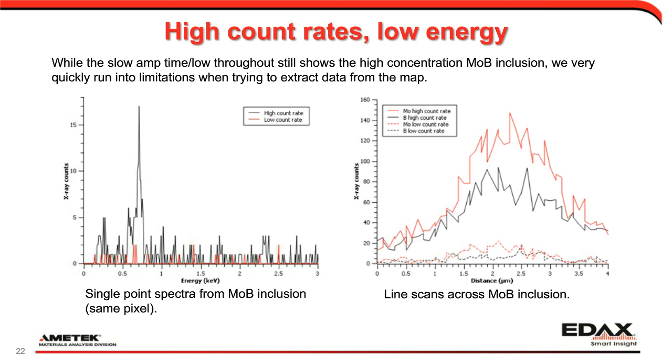And my boron peak, I actually have no counts in the low count rate, whereas we start to make out a peak in the high count rate. And take into account this is 1.6 milliseconds acquisition time. So it is rather noisy, of course, because of the low acquisition time, but we can still pull out meaningful data.